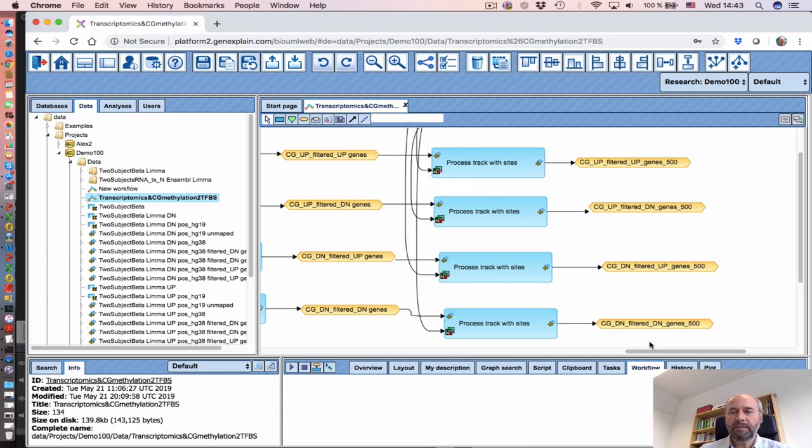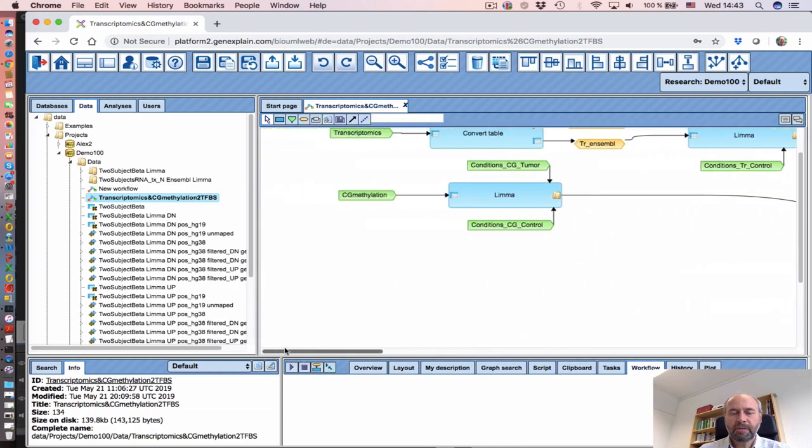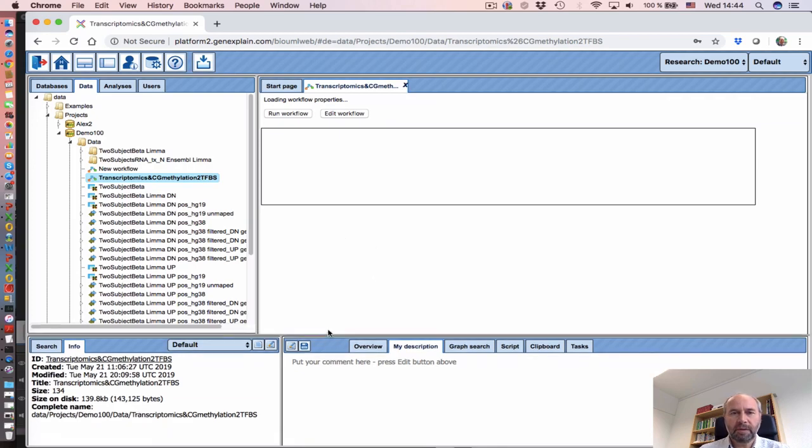So when this workflow is ready, we can basically start it. So for that we click on this button, so to initiate this workflow. Now the runtime environment is created for this workflow. So it will be ready to start and to put the data in the initial parameters, and then run the workflow as we have seen it before at the beginning of the small example.